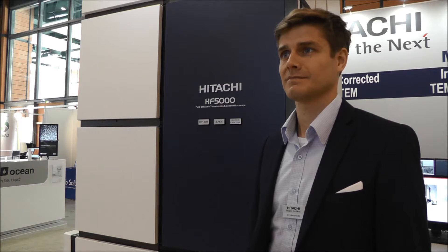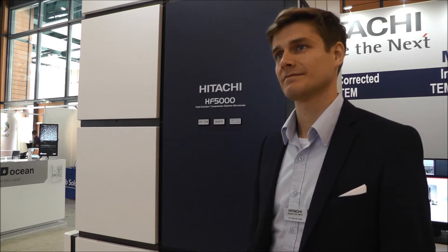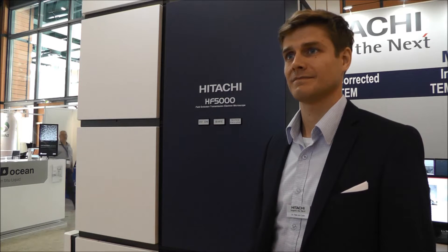Good morning, Dr. Felix von Kuber from Hitachi. We're here at EMC in Lyon. Could you tell us about Hitachi's newest TEM?